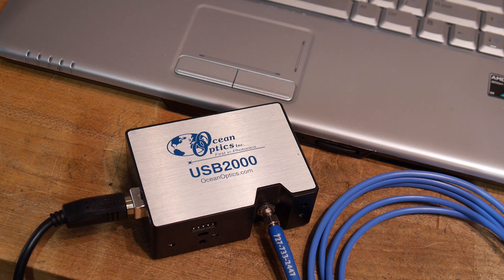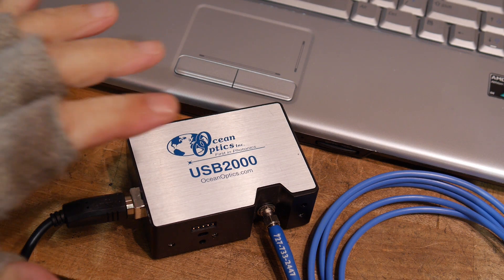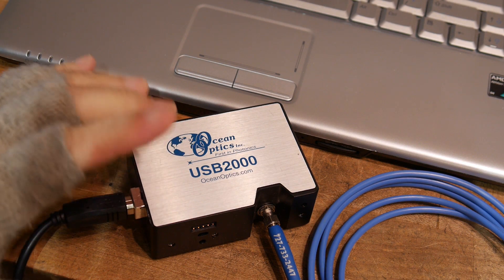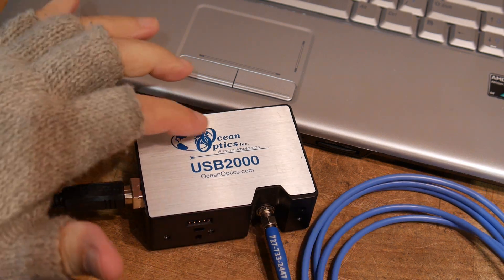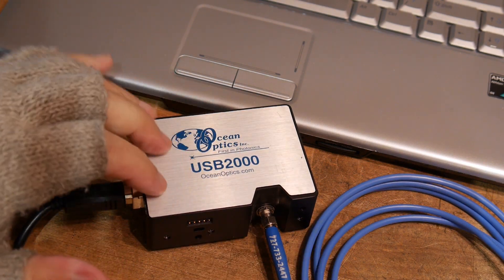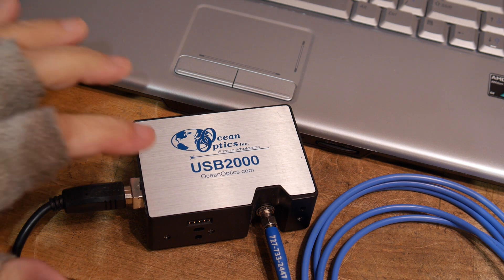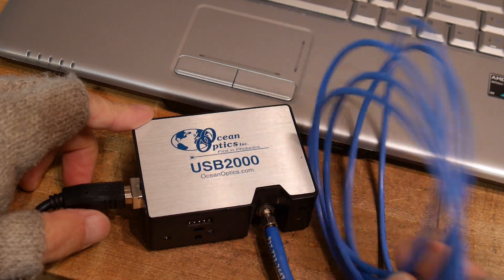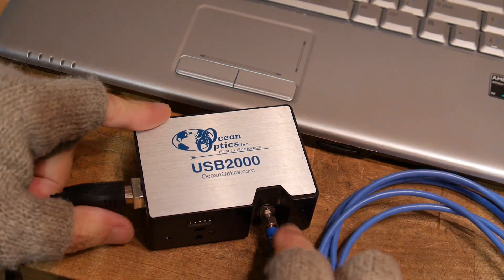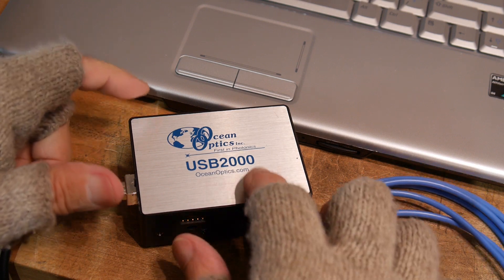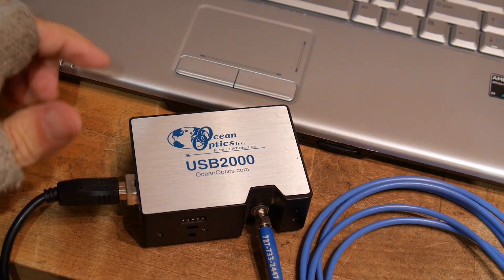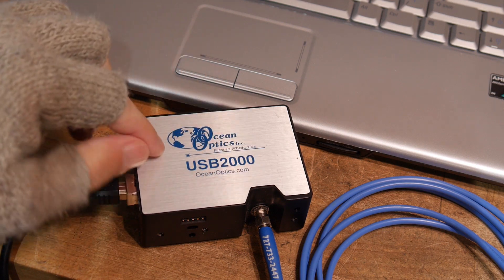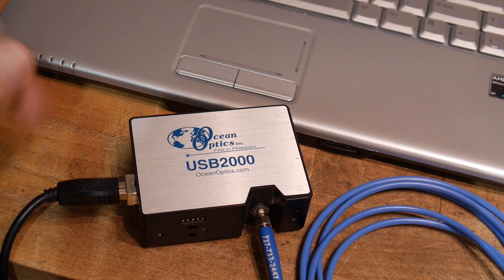Alright, so I shot one video with a spectrophotometer and another one with a monochrometer. This is another spectrophotometer. It's an Ocean Optics USB 2000. This is a very old model. How this works is there's a fiber optic input. There's a port here in the front where the light goes in through the fiber optic and enters this chamber. There's some mirrors in here where it bounces around, but basically it hits a diffraction grating which makes a rainbow.